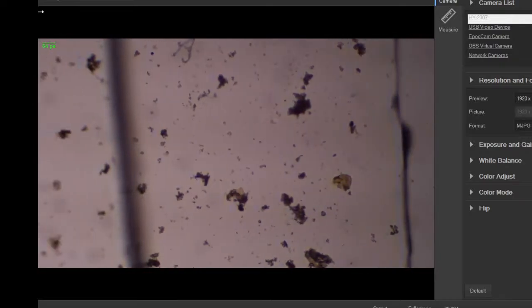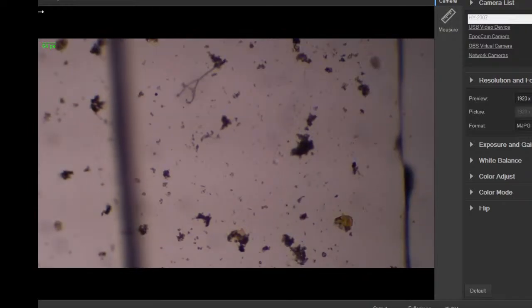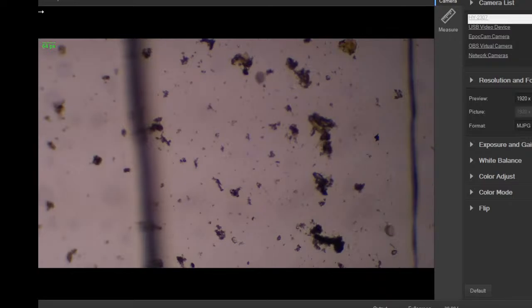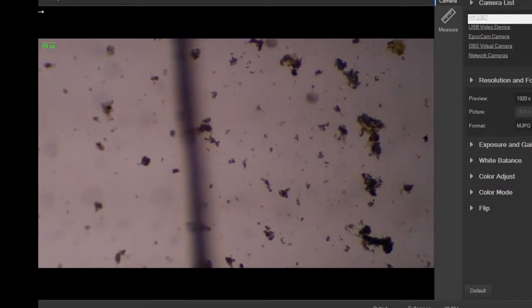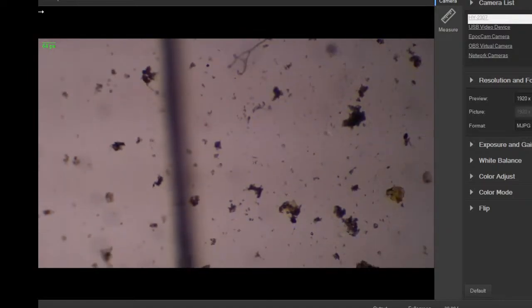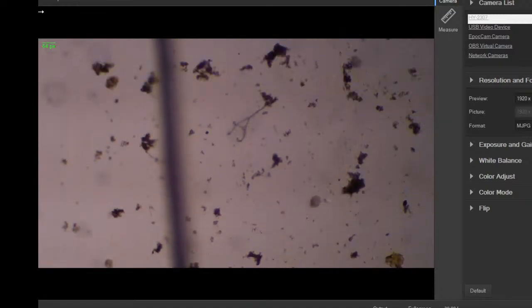There you see a couple of those little guys I was calling Vorticella. When they attach on a stalk they can look like tiny little wine glasses. An open cup with a ring of cilia, and then the stem of the wine glass is like these little coil attachments they have.